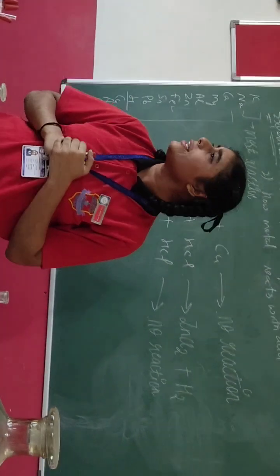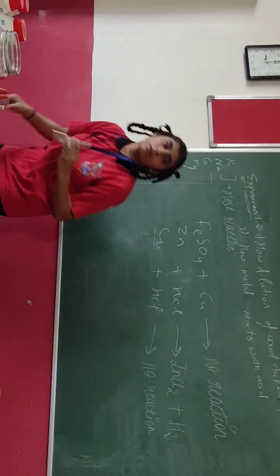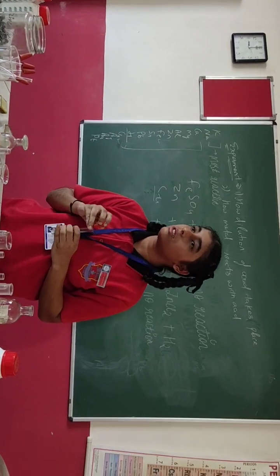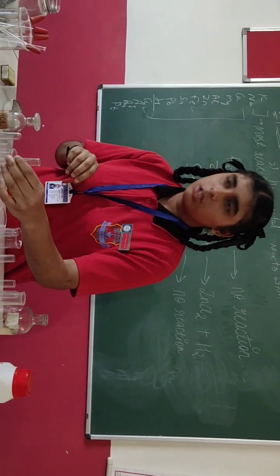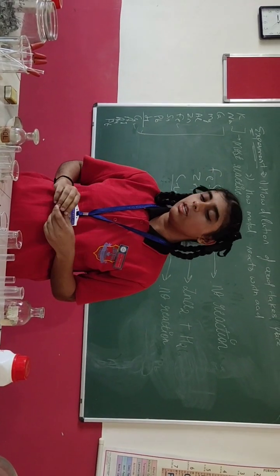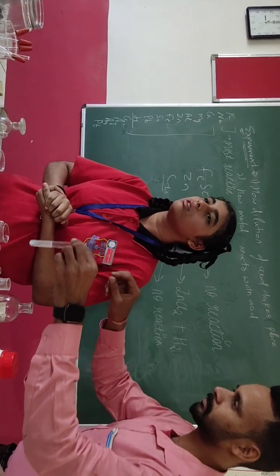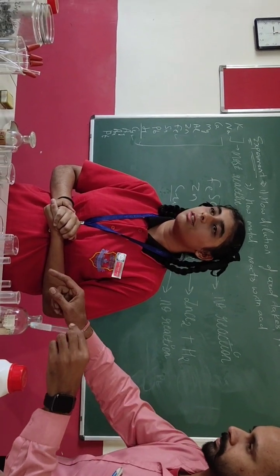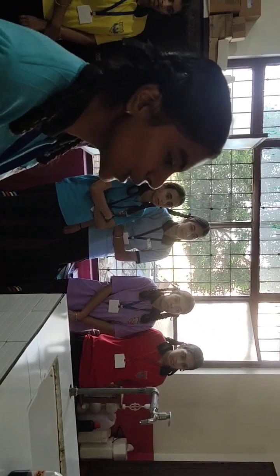Now, a question may arise in your minds: how do we know hydrogen gas is released? As already explained, we will put a fire near it and it will produce a pop sound.